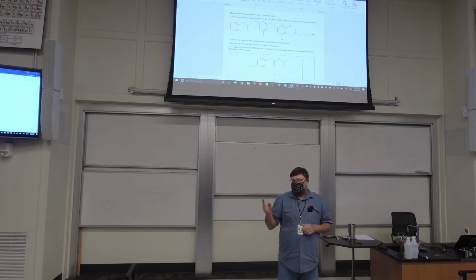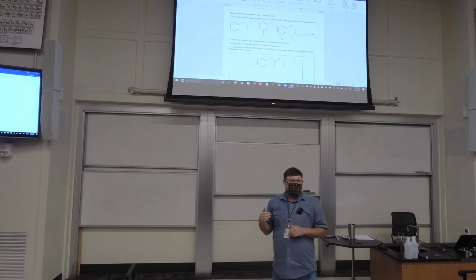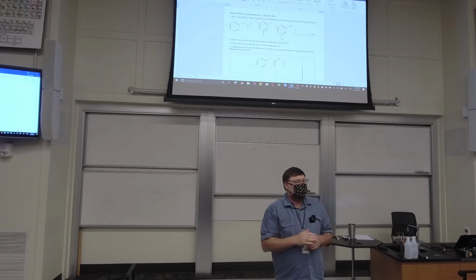Folks at home should work the worksheet. Obviously, you don't have to sit here and watch us just look at each other. So fast forward. Go ahead and start number 1. I'm just asking for how many different signals in the proton and the C13 NMR would appear.